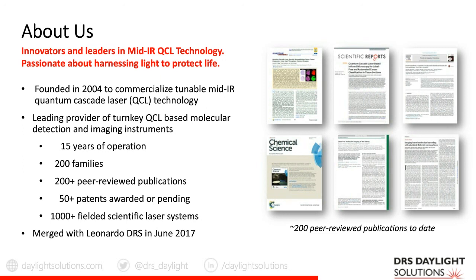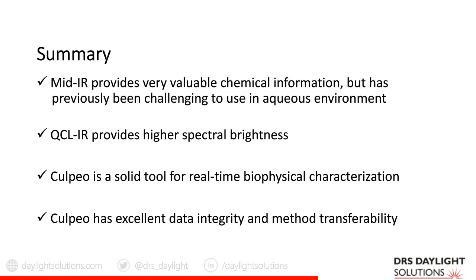To summarize for today, mid-IR provides very valuable chemical information for your bioprocess analytics. It overcomes the challenges of working with aqueous environments. This is primarily due to the high spectral brightness, and we've shown that QCL is a solid tool for real-time biophysical characterization. It maintains a very high level of data integrity and ease of method transferability downstream.